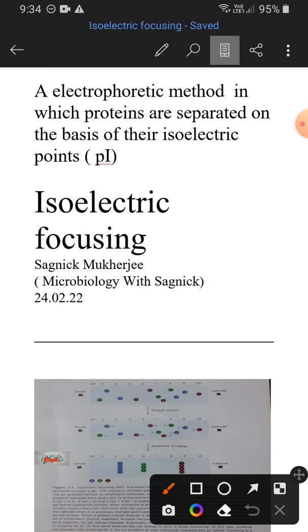In case of aspartic acid, we have COOH in the acidic group, in the side chain. In case of lysine and arginine, we have an amino group in the side chain, right? So in such cases, we have to take the charge of the side chain also under consideration.